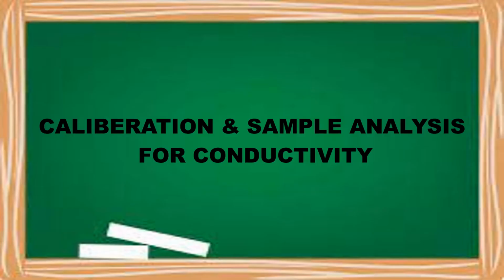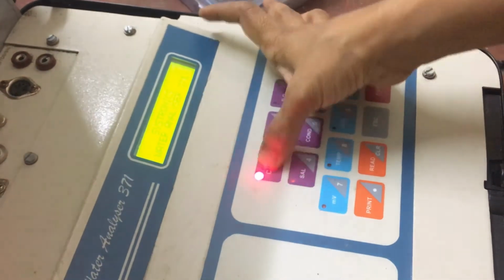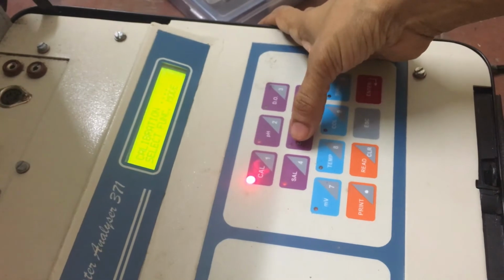Next is the calibration and sample analysis for conductivity. For calibrating conductivity, first we need to press cal and then press the function that we are calibrating, that is conductivity.